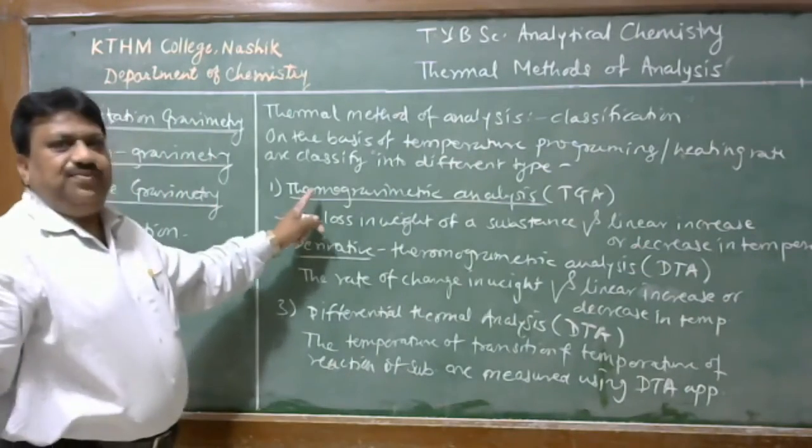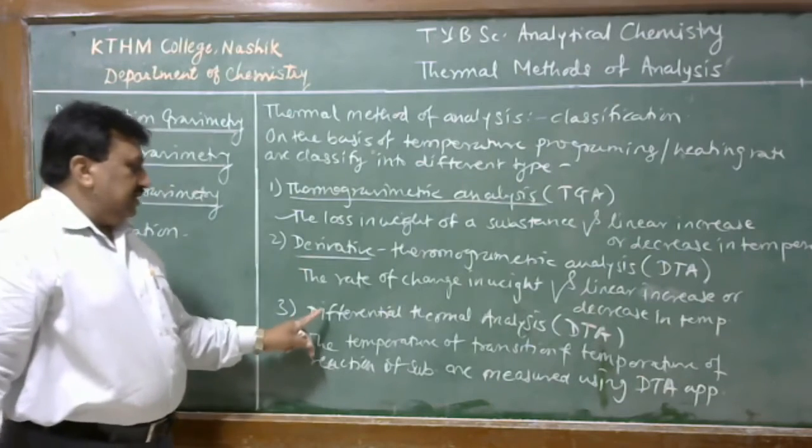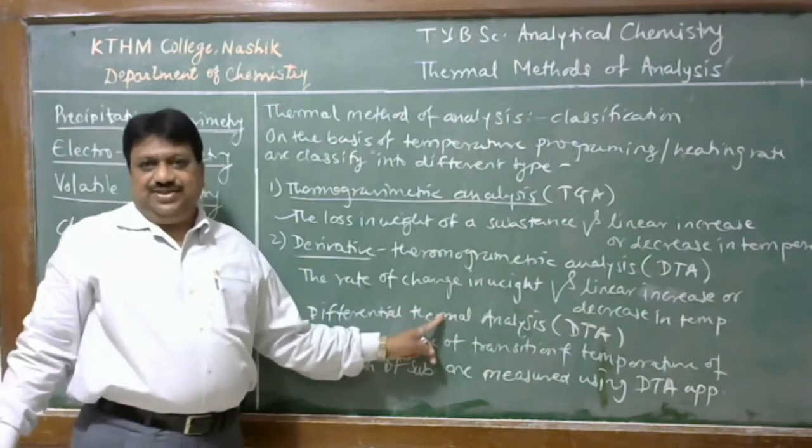Therefore, the first three types are thermogravimetric analysis, derivative thermogravimetric analysis, and the third one is differential thermal analysis.